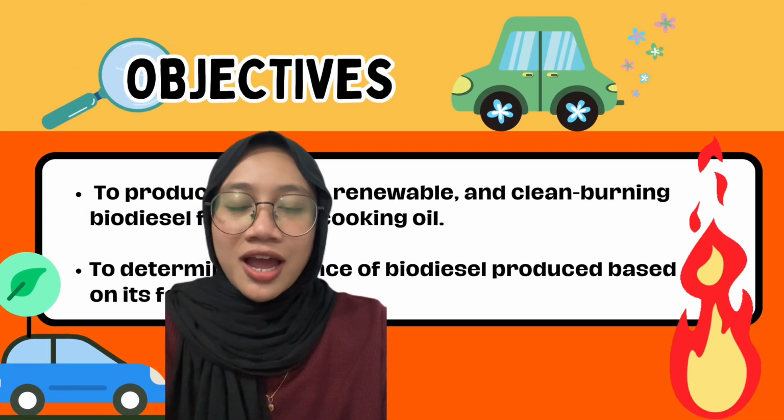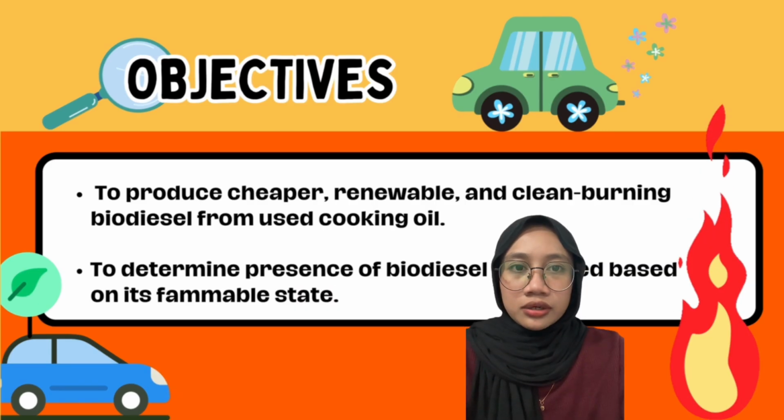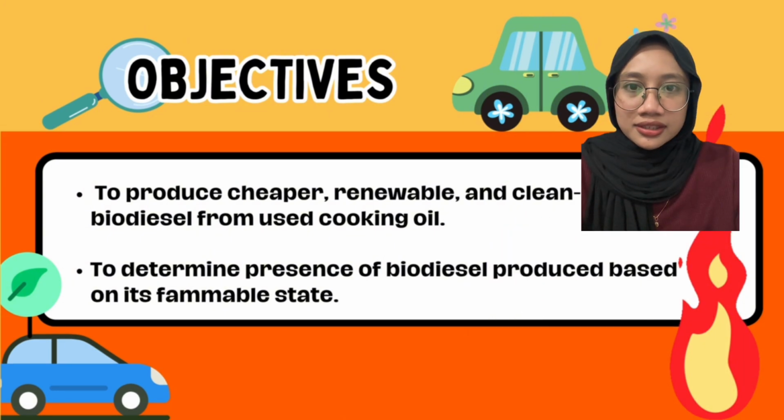Next, let's discuss our objectives. The primary goals of this experiment are to produce a cost-effective, renewable, and clean-burning biodiesel from used cooking oil. Additionally, we aim to determine the presence of biodiesel produced based on its flammable state.